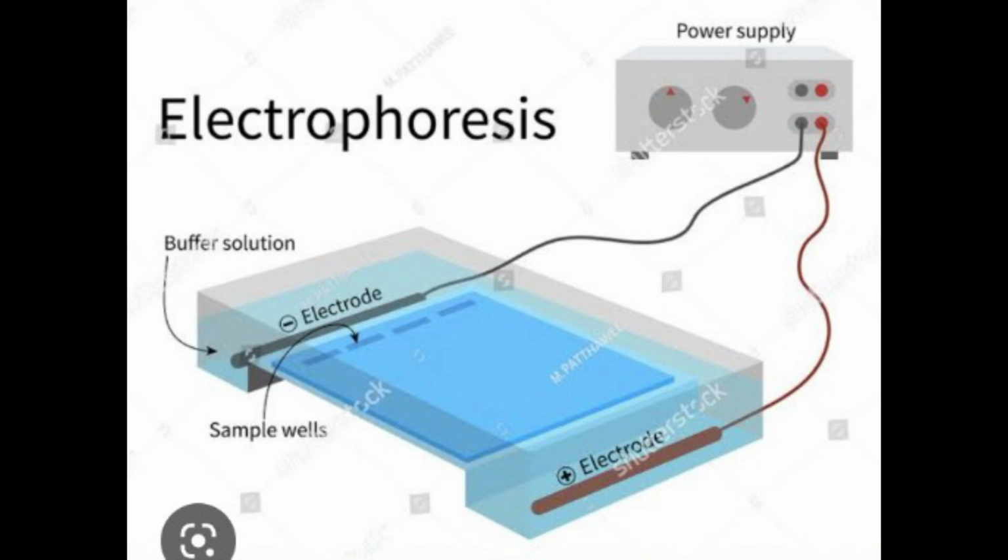Apply the sample by using a micropipette to carefully add approximately 25 microliters of protein in DB1 and/or DB2 to the bottom of the well. The volume and the protein concentration of the sample should be sufficient to give at least 10 micrograms of each protein. If possible, avoid using the end wells. Apply 15 microliters of molecular weight standard to 1 or 2 wells, preferably in asymmetric positions to allow the front and back of the gel to be identified. Carefully record the content of each well.